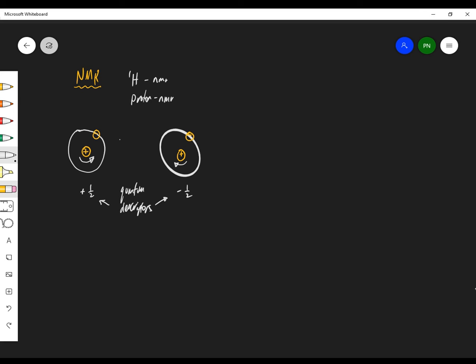There is a method of finding out how they spin. It's how you grip a pencil in your fist and the angle of your thumb and the way your fingers wind around things. So you can actually tell the way things spin, but we're not going to go into that. Anyway, when we have a little proton spinning, it creates a current, and a current produces a magnetic field. So from this, we can imagine the proton as a little bar magnet. And this proton will be another bar magnet, but with the opposite direction. So if this one is south and this one is north, this one will be north and this one is south. So protons have this property called spin.